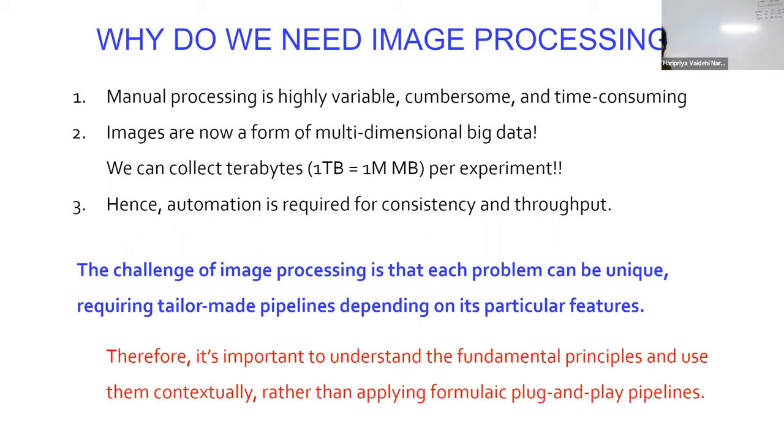But given the caveats that Jason and Giancarlo brought up, I am going to put it forward to you. When you're developing your pipeline, it's actually crucial that at many stages you do eyeball what is going on. You do stop and be a human in the loop, looking at whether you're computing the right kind of data that you're interested in. Take a look at your image after every operation you do to it. It's a sanity check. Your eyes are a sanity check. If your eyes can't tell what is happening, your computer cannot tell what is happening.